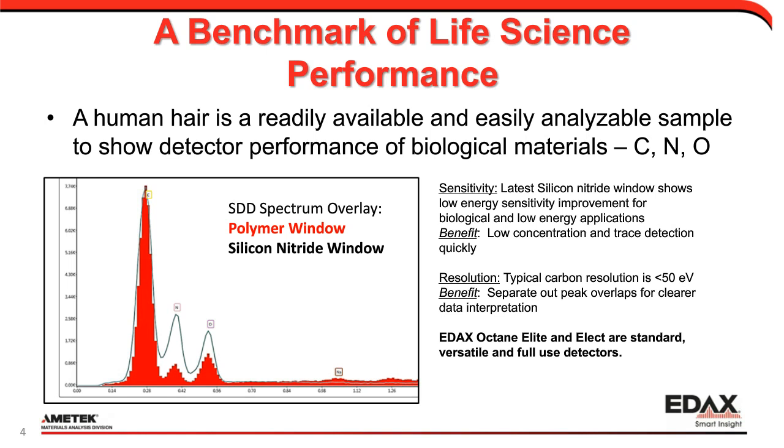In fact, we hear resolution a lot in microscopy, and they do mean slightly different things depending upon how we use them. So in the EDS world, resolution means the ability to distinguish two or more peaks from each other. And these are usually neighboring peaks. So for example, carbon, nitrogen, and oxygen are in sequence. And so the ability to tell the difference between the carbon, nitrogen, and oxygen peaks is very important because then we could determine what elements are present in our sample.